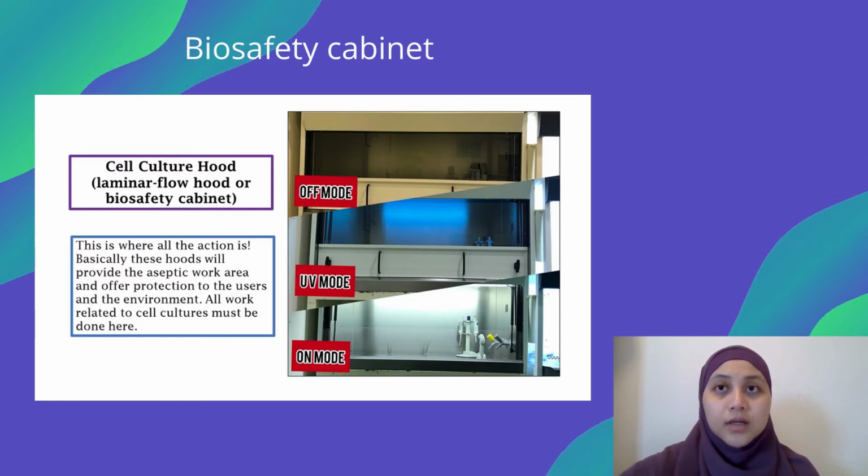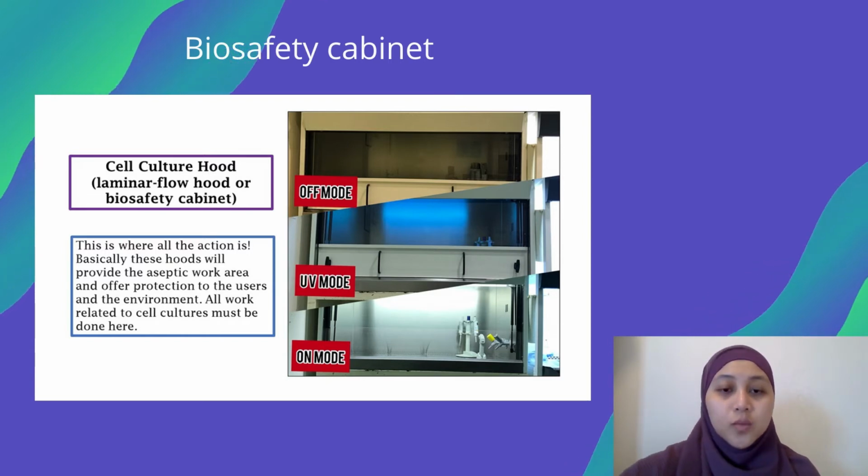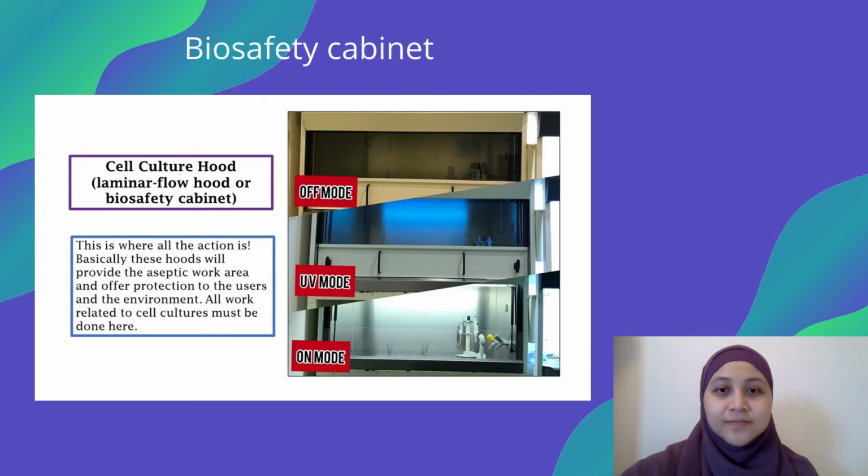While doing your work, any fluid spills such as media must be wiped immediately with 70% alcohol to prevent contamination. Make sure you clean the working area in the BSC after use and turn on the UV mode to ensure the BSC is clean for the next user.